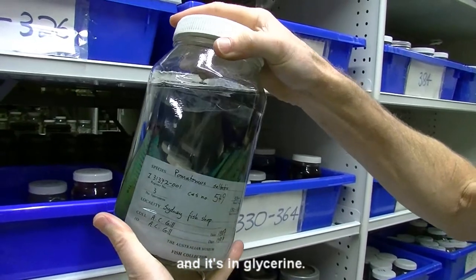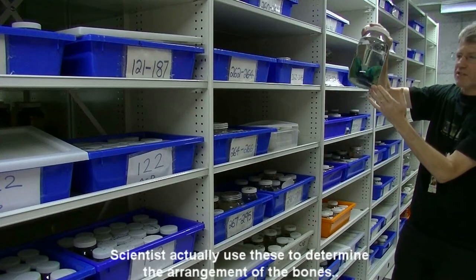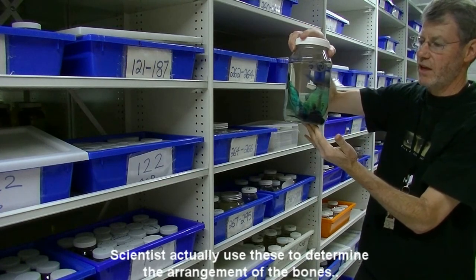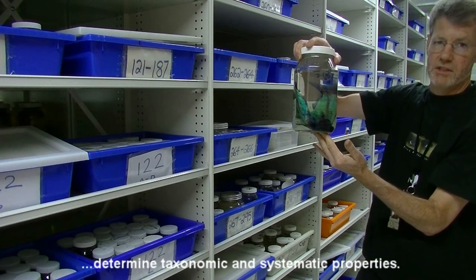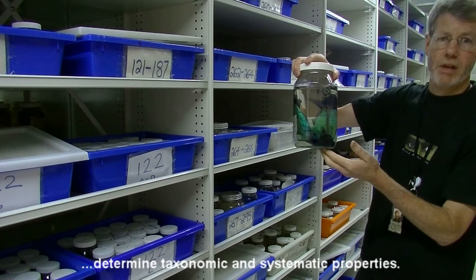And it's in glycerin. Scientists actually use this to determine the arrangement of the bones, the layout of the bones. And by doing that, they can determine all kinds of taxonomic and systematic properties — obviously the classification and the evolutionary relationships.